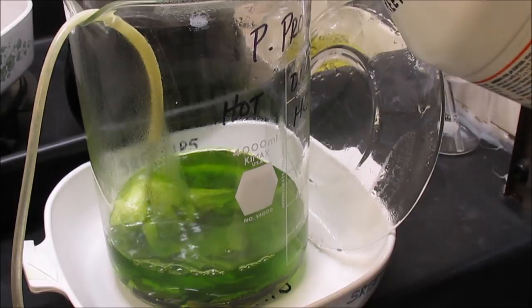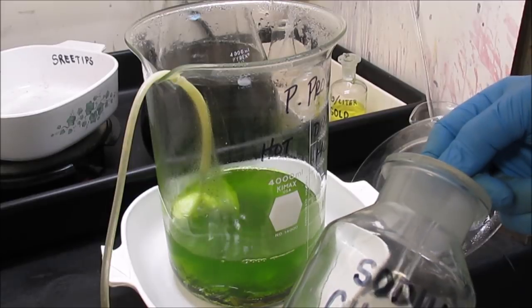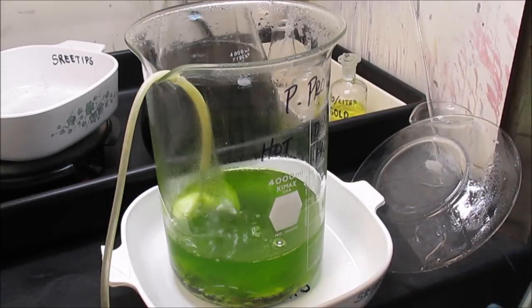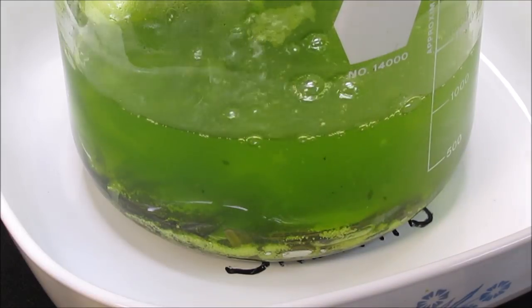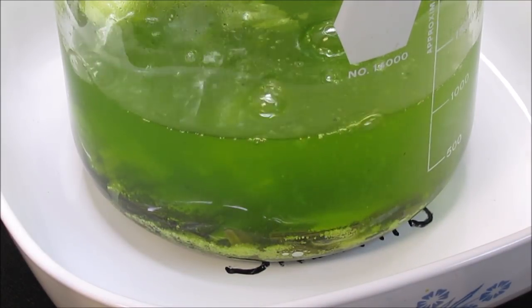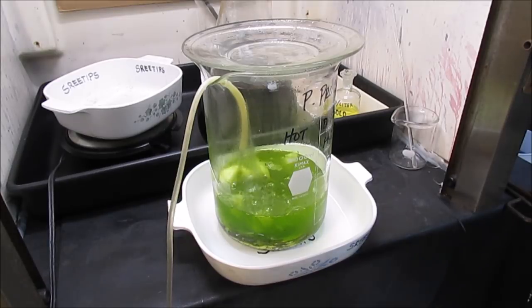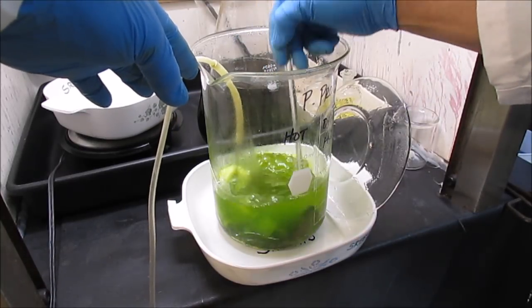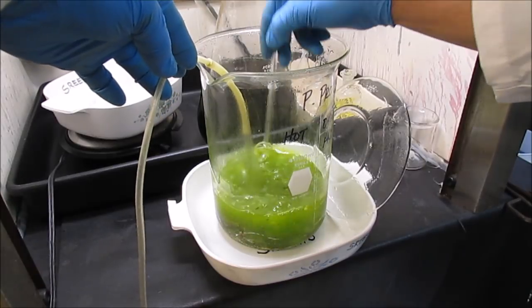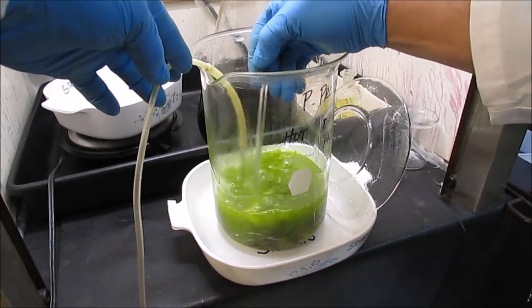I'm going to add about 200 more ml of hydrochloric acid here. Now I'm going to add another spoon of sodium chlorate. This will be the third one. Put the lid on. I'll give it a quick stir here. Definitely got some chlorine gas evolving off the mixture. I'm seeing gold foils in there too. So we got a ways to go before we got everything in solution.